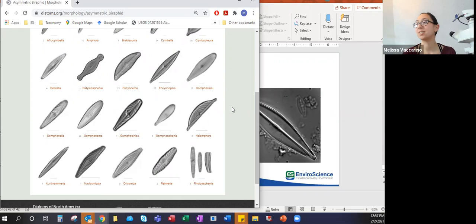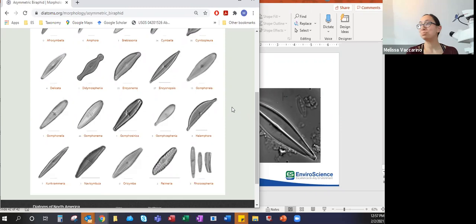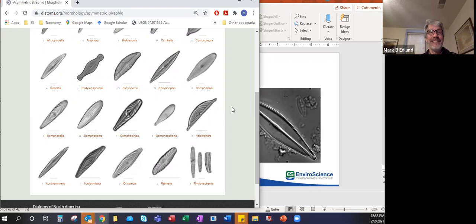Okay. And is having a camera on top really important for analysis? In our case, we are taking pictures for the client, so yes. But what's nice about it is, like you saw me demonstrate, you can take a picture and put it right next to the diatoms.org image for comparison. You can also take a bunch of pictures across the slide and line them all up for comparison. So for speciating the diatoms that you have, the camera can be valuable. Yeah, I really liked how you showed us how we could have the overlying screens like that. I have actually never done that. I thought that was great to just have them both sitting there open, and what a super way to do that comparison.